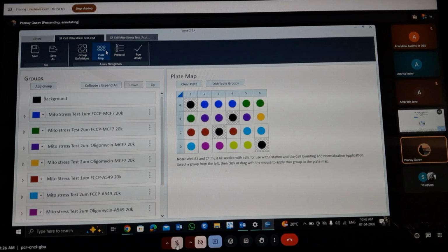Okay. Got it. Right now, just for the sake of explanation of how different kinds of injections work, I created different concentrations of compounds. But once I know that a specific concentration of those compounds works for me, then in the next set of experiment I will add my compound as a pre-treatment. While we are setting up the concentration of these compounds, the optimization, it's better to do that without treating cells with any compound, like any drug.